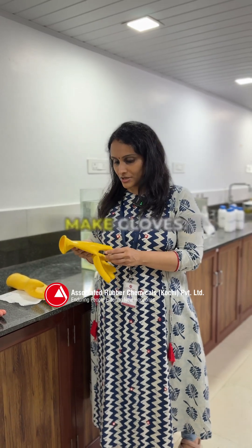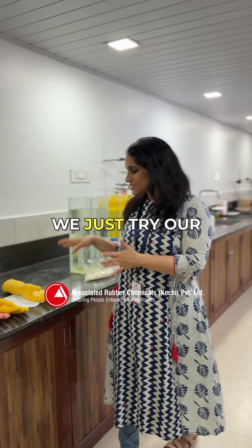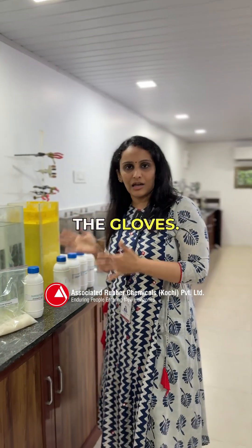In our lab we will show you how we try our composite dispersions to make the gloves.